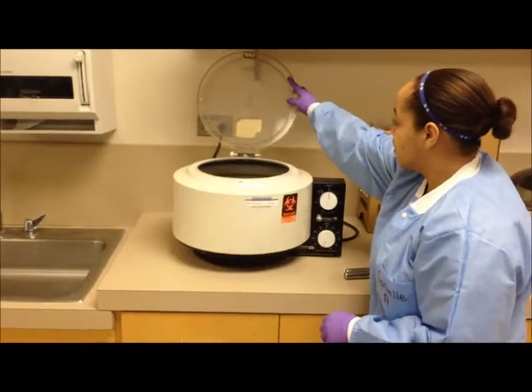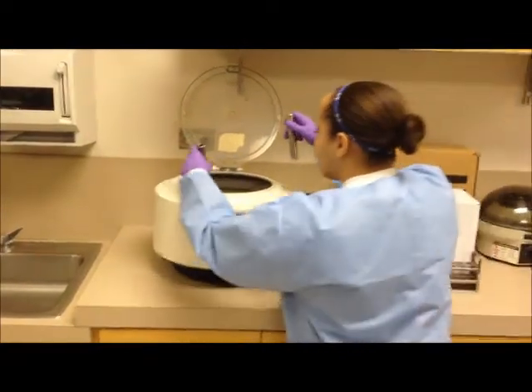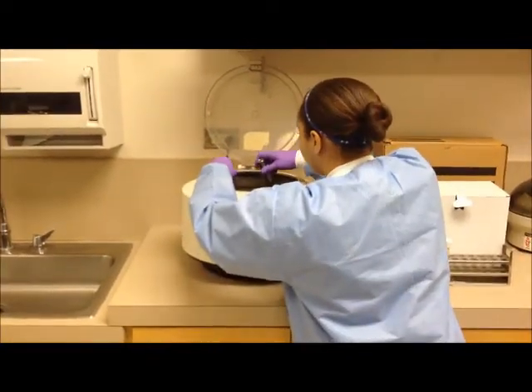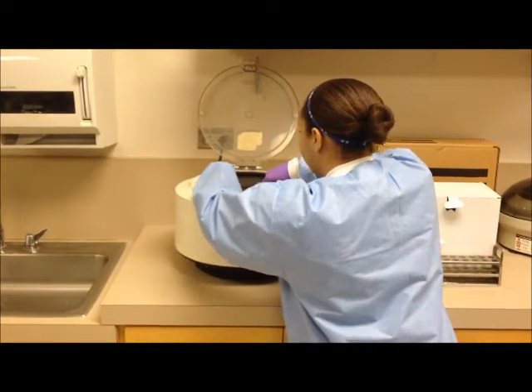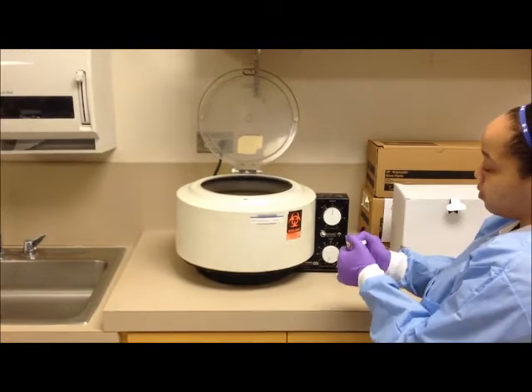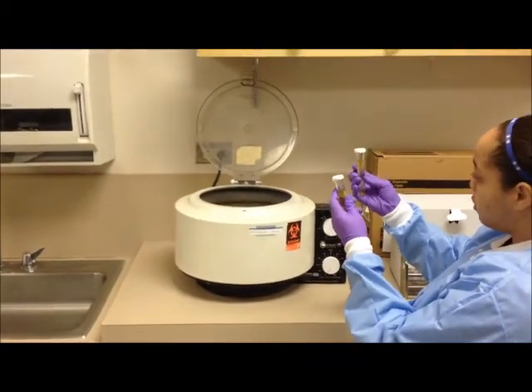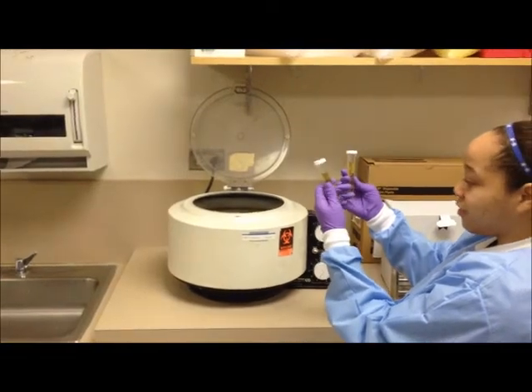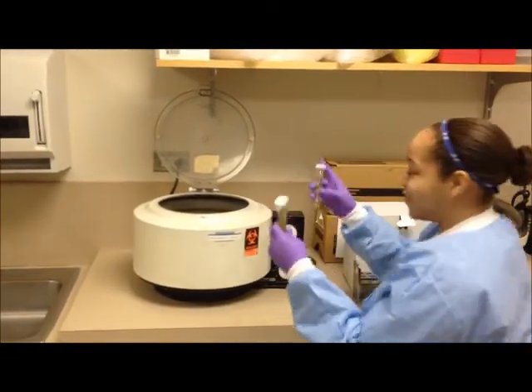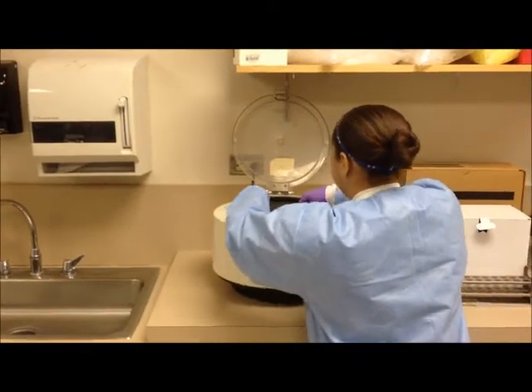Here's Danielle opening the lid and placing the shields on opposite sides. Now she's going to inspect the test tubes and make sure they are sealed and intact, checking for cracks — no cracks. With solid test tubes, she places them inside the shields and closes the lid.